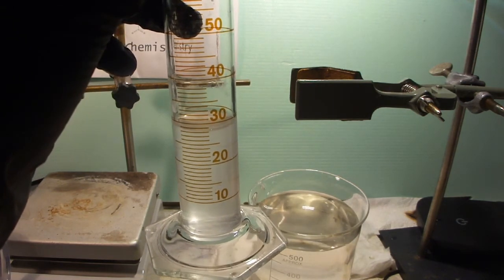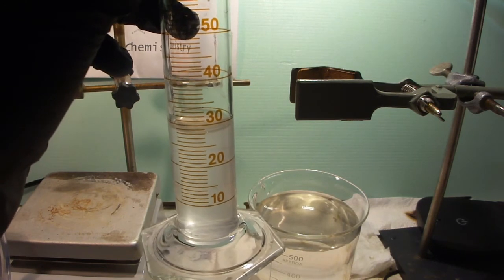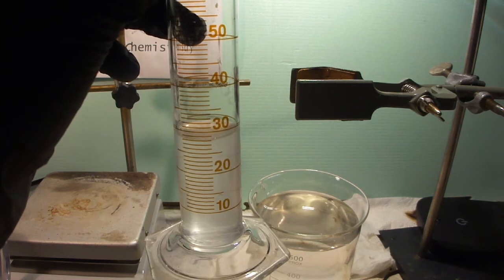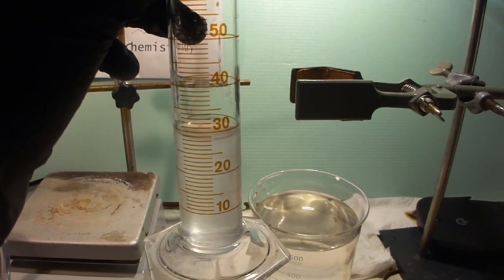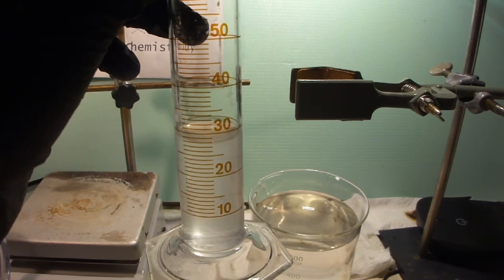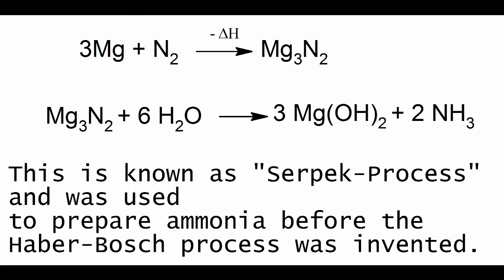Now we have proved that the gas in the cylinder must be nitrogen or a noble gas. If we would like to distinguish between nitrogen and a noble gas, we could lower a burning piece of magnesium ribbon into the cylinder. In nitrogen, the magnesium would continue to burn, forming magnesium nitride. In a noble gas like argon, it would extinguish.